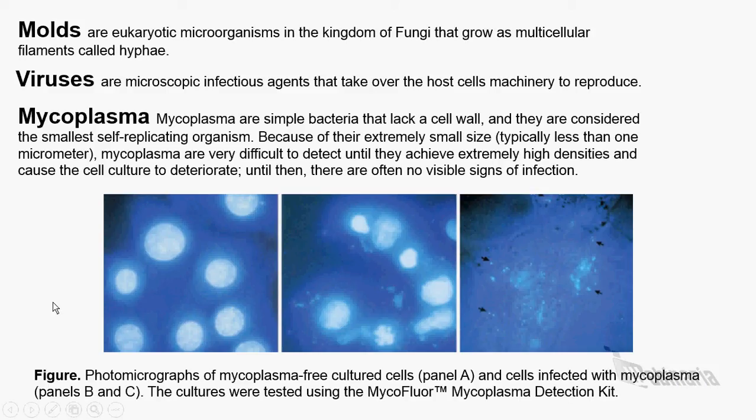In this picture, you can see a healthy culture of cells, and in this case, you can see the cells are being infected with mycoplasma. Okay, and further, the infection is very, very dense over here, and this contamination was detected by a mycoplasma detection kit, MycoFluor.